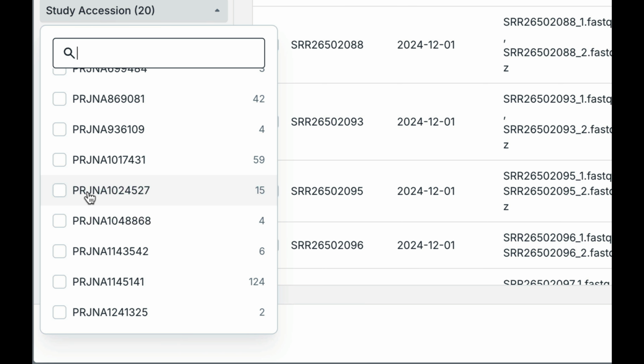So these IDs correspond to an experiment. If, for example, your lab is performing sequencing of a virus, and then it's going to publish these results, it's going to deposit them to NCBI SRA. And when you do this, you will create a project for yourself, and your runs will be associated with this project. So it's kind of a container for storing data associated with a particular study.